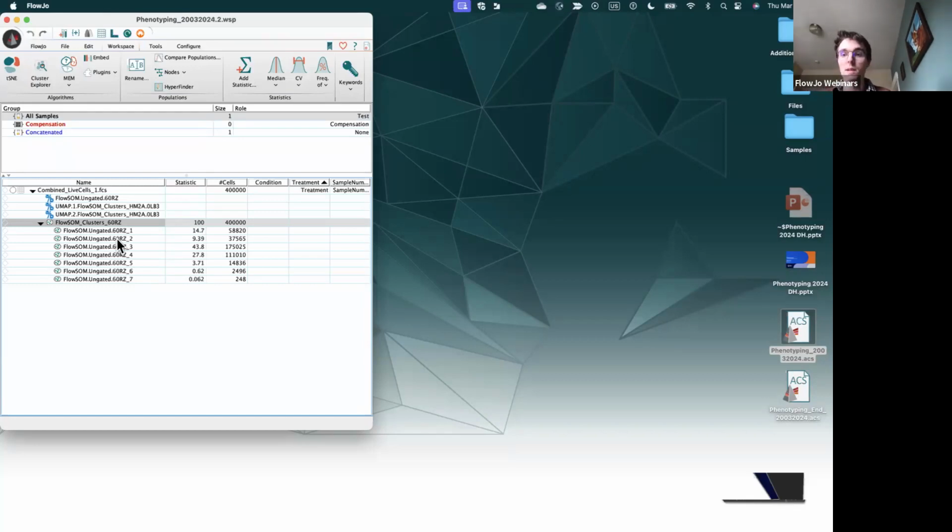The alternative would be we could run something like XShift or Phenograph. It would probably return 30 clusters to us, and I think that's fine. It's just we then have to go through and identify each of the clusters. It's going to get all the different subsets probably, and so we'll just have to go one by one through each cluster to identify what those subsets are.